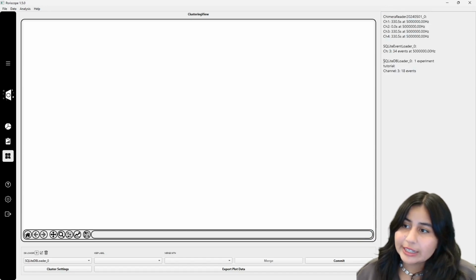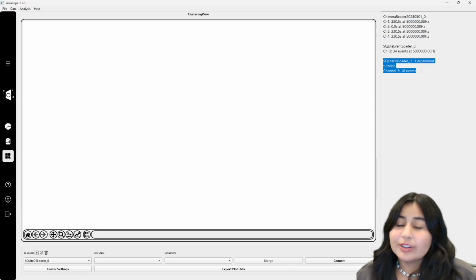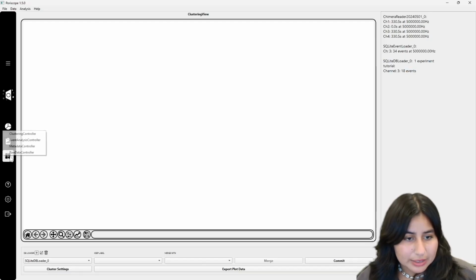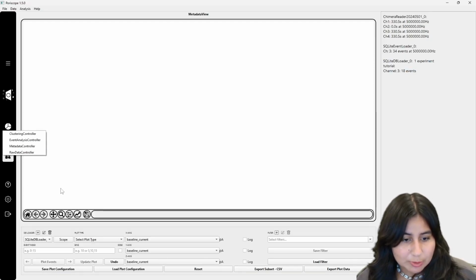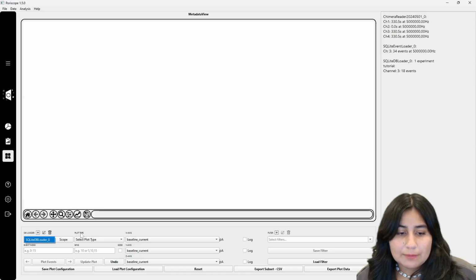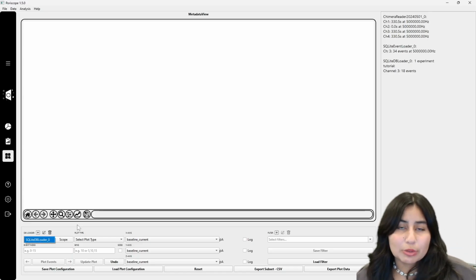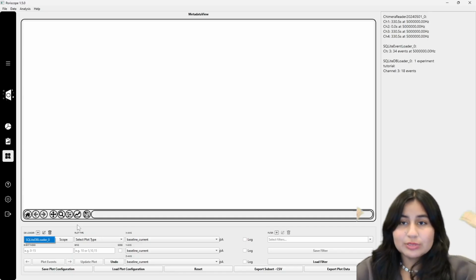Another important thing is you can see that the fitted events database is only there once, because both metadata and the clustering tab use the same one. So you don't have to load it once here and then once in clustering. If you do it once in any of those tabs, it will appear in the other. So that is really practical. So that is the core workflow.